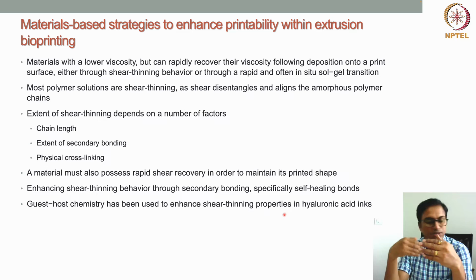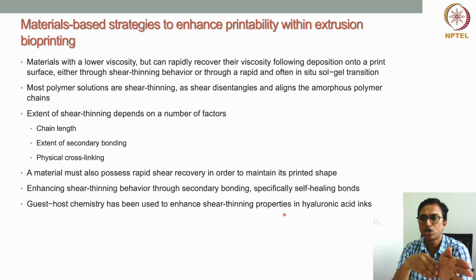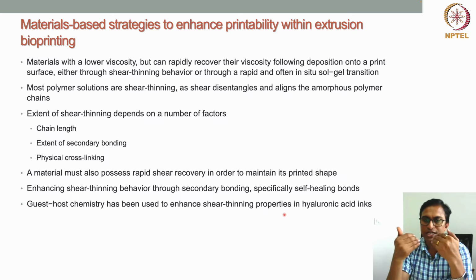it should gel immediately. So that transition from sol to gel state should be very fast, almost instantaneous. In this way, we can improve the printability of certain low viscous materials.